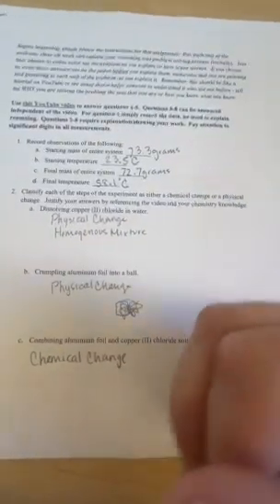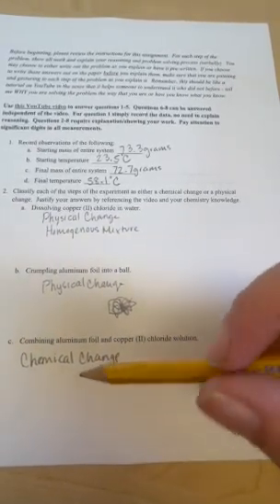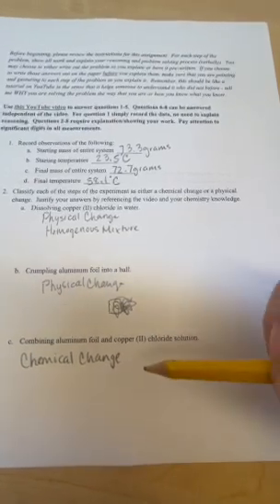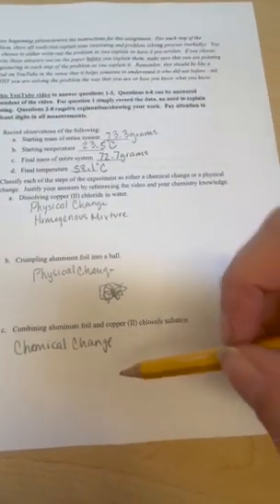Bonds are being broken, different molecules are being exchanged between the aluminum foil and the copper chloride, and lots of stuff is happening here. Things are breaking down, other things are forming. No loss of energy, but we're just creating something new here. So we're gonna go on to number 3.